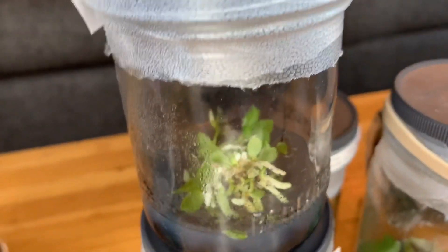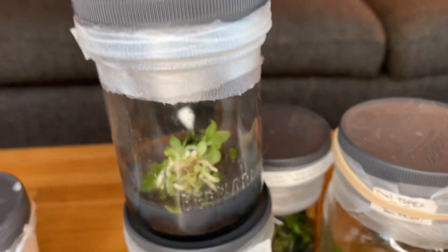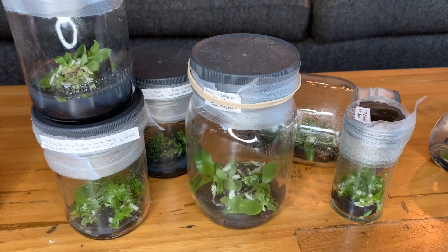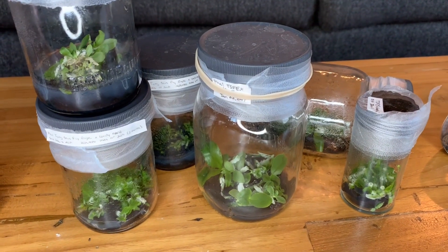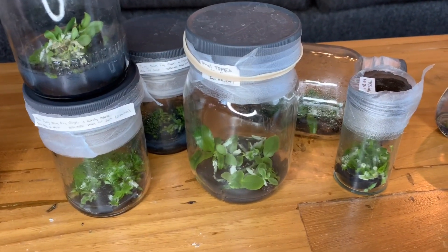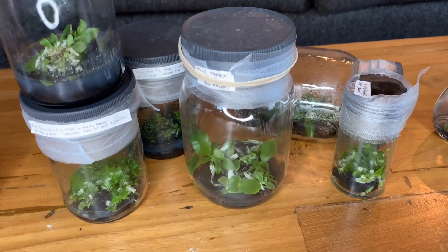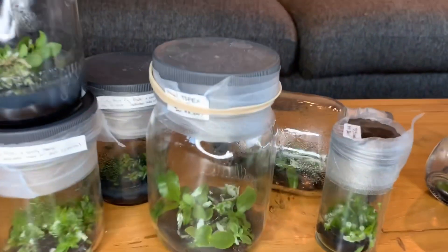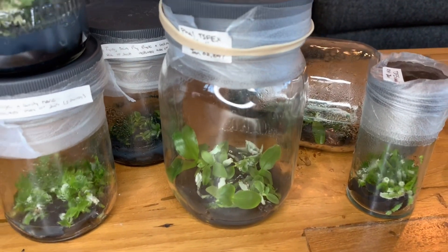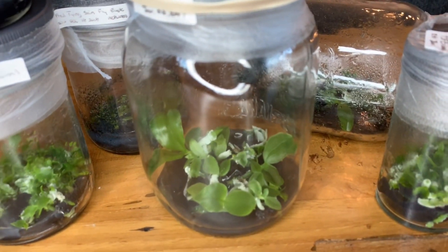These ones I replated most recently and they don't look super great. I had to tear some apart, and I'm experiencing this thing where the protocorms are proliferating or multiplying, which means any of the protocorms from a mass will be a clone of the same one — which you don't really want, because if you flower a crappy plant, then you've got a bunch of crappy clones. We'll see how that goes. I think they're probably getting close to deflasking size — maybe another two or three months, maybe longer. The bigger one I could deflask now; some of the smaller ones inside I probably want to let grow up.